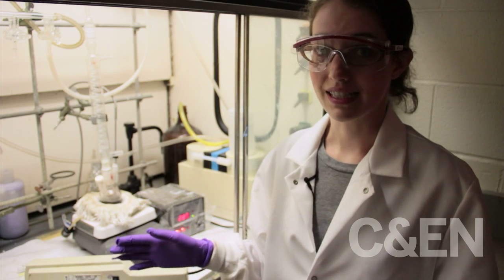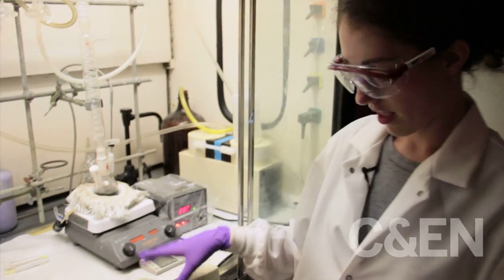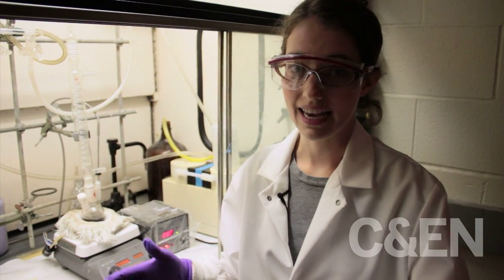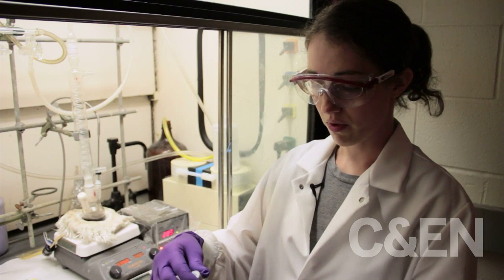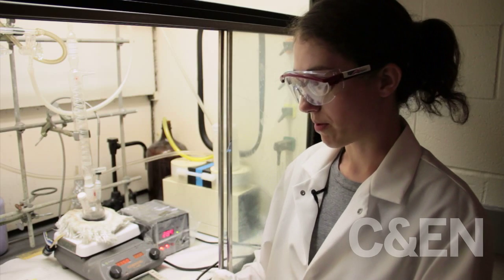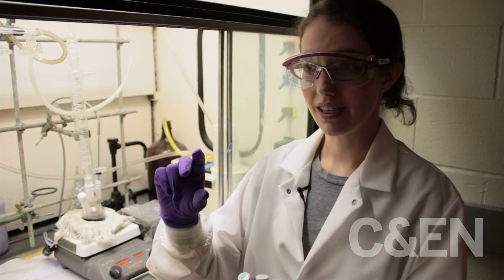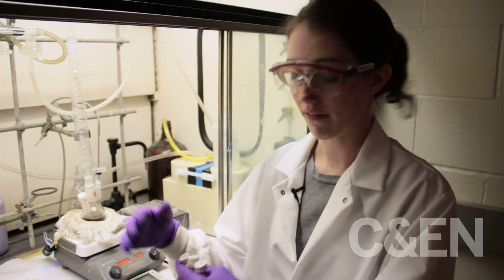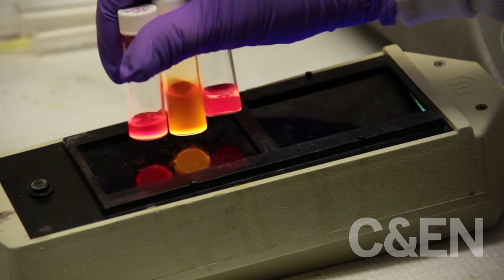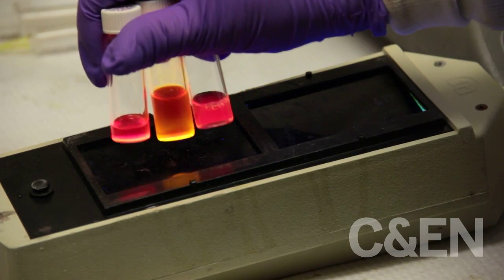After that whole process is complete, we end up with the finished product, and these we can tailor to be different colors. But these are in chloroform or hexane — an organic solvent. If we want to ever use them with things in the body, we need to put them in water. In order to put them into water, we end up usually with a much more dilute solution. We cover them with lipids, which have two components: they coat the quantum dot with the hydrophobic portion, and then the exterior of the lipid is hydrophilic, or water-loving. The reason they fluoresce is because they're excited with UV light, so when we take away that UV light, they no longer glow.